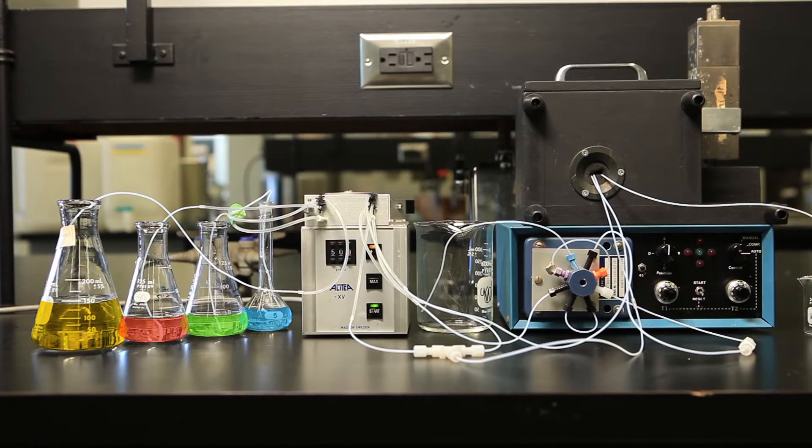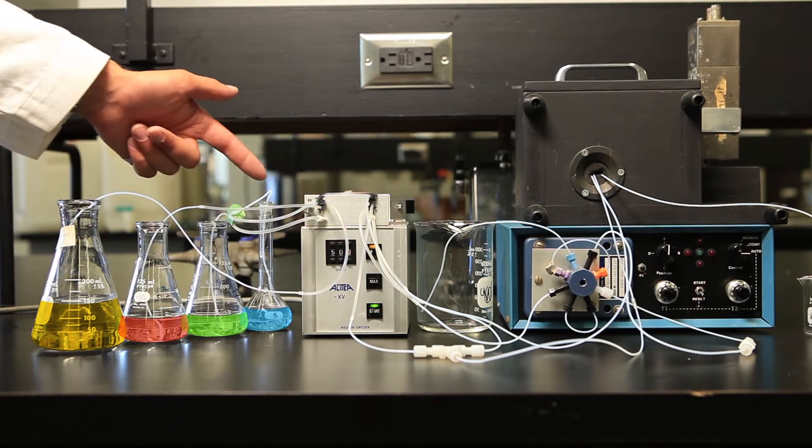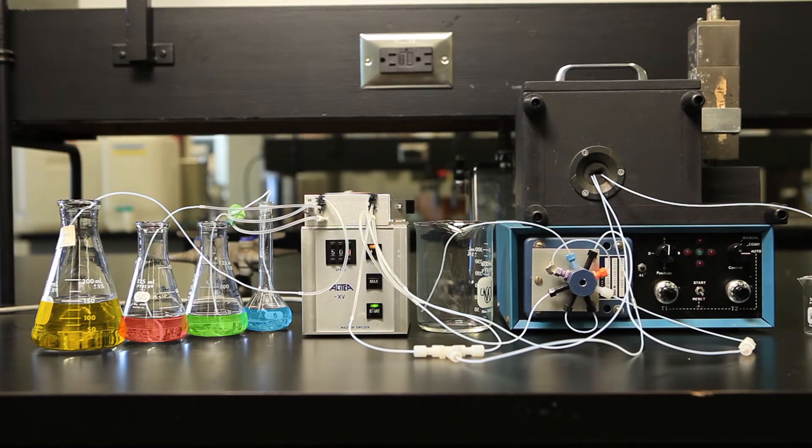Next, we'll look at the setup for flow injection analysis. The sample and reagents are pumped into the instrument through these inlet tubes. Here, we're animating the pumping of colored solutions so you can see what's happening. However, in the experiment, the solutions are colorless.